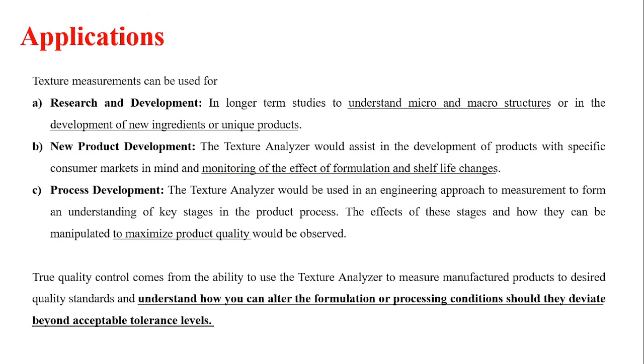There are multiple applications of texture analysis. It is used in research and development, in longer term studies to understand micro and macro structures, or in the development of new ingredients or unique products. It is also used in new product development to monitor the effect of formulation and shelf life. It is also used in process development to maximize product quality.